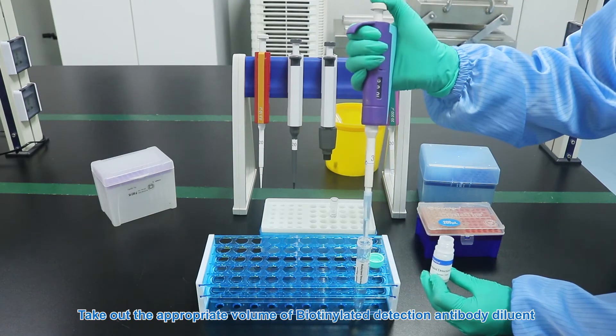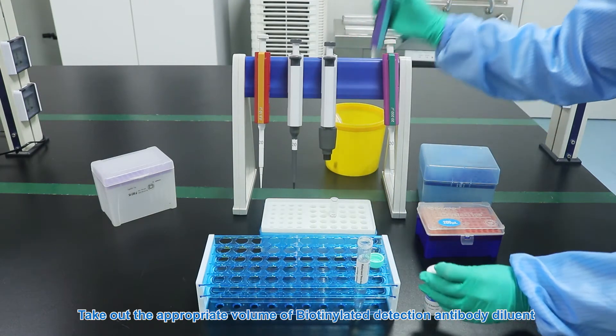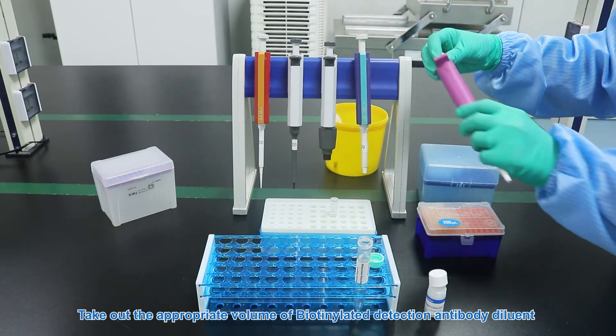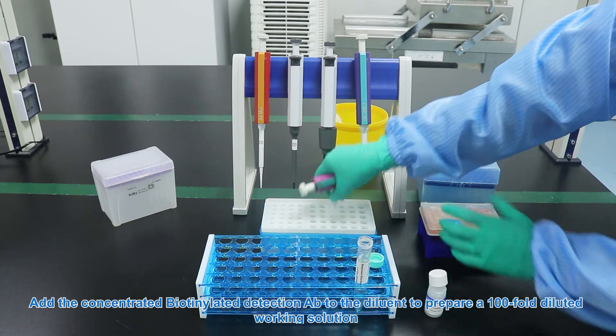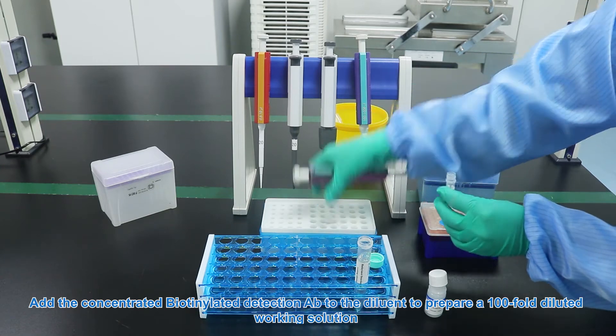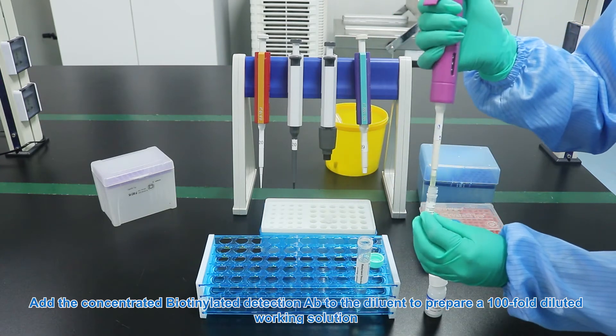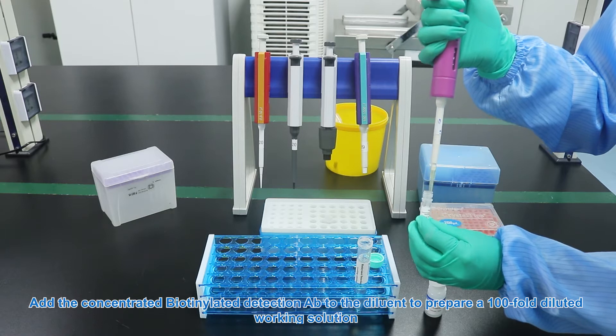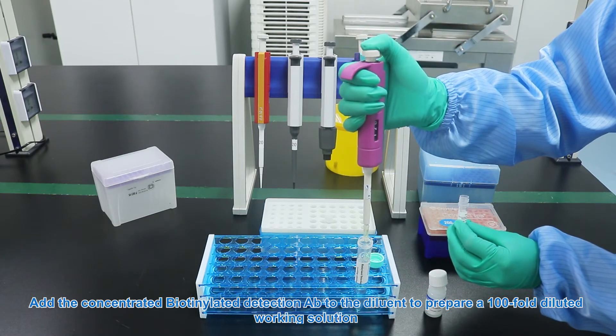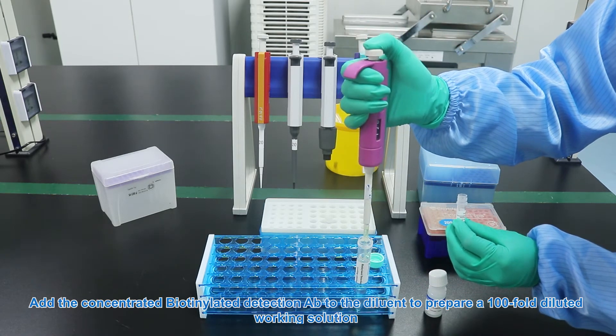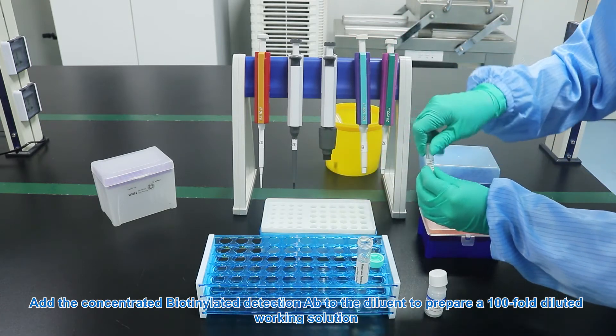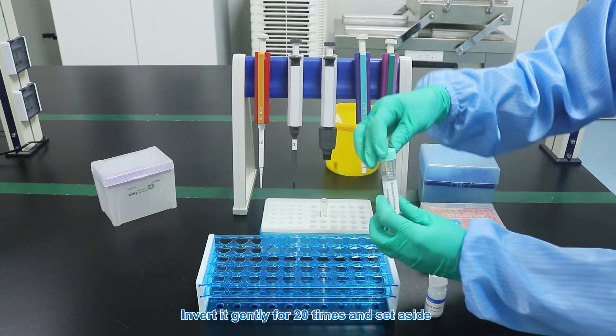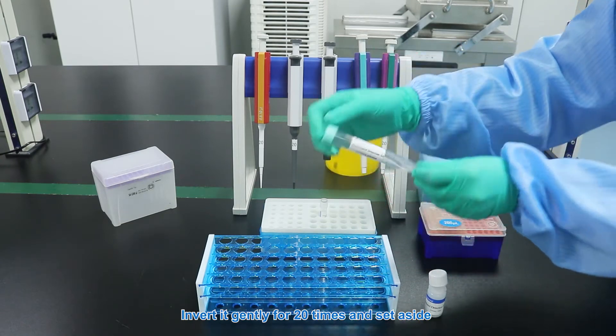Take out the appropriate volume of biotinylated detection antibody diluent. Add the concentrated biotinylated detection antibody to the diluent to prepare a 100-fold diluted working solution. Invert it gently for 20 times and set aside.